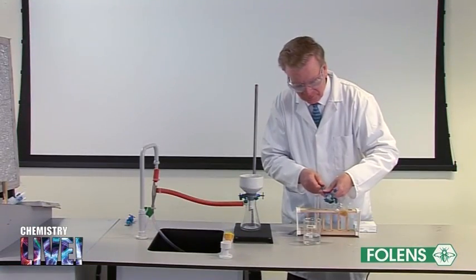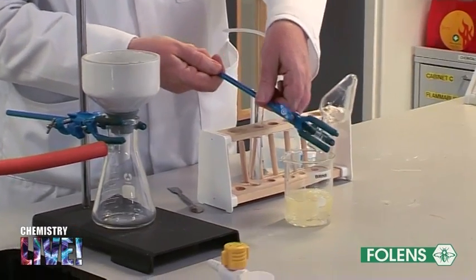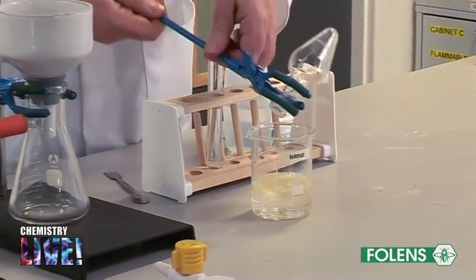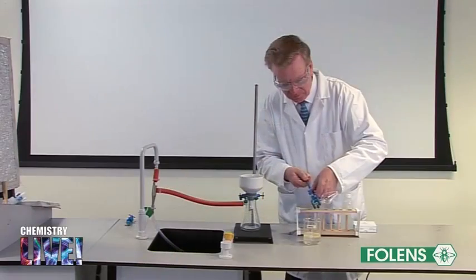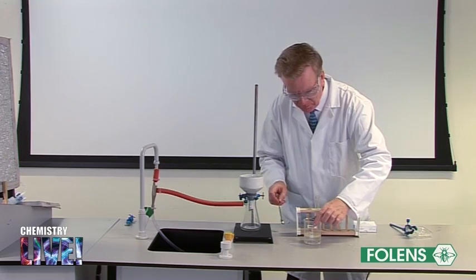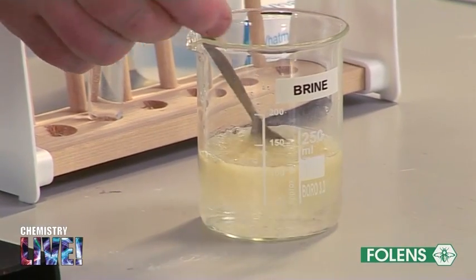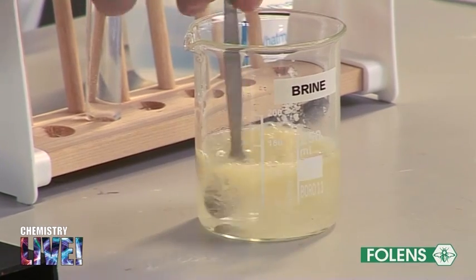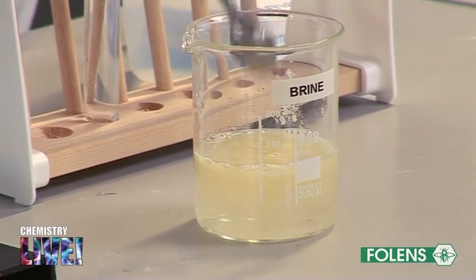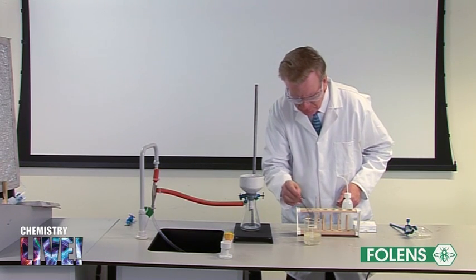Using the clamp to hold the flask, quickly pour the hot reaction mixture into a beaker containing 100 cm³ of concentrated brine. Brine is a solution of salt, NaCl, in water. Soap does not dissolve in salt solution, therefore the soap will be precipitated. The excess sodium hydroxide will dissolve in the salt solution.